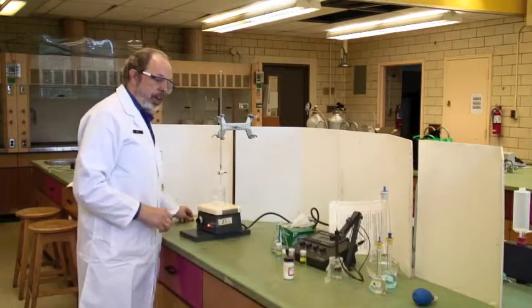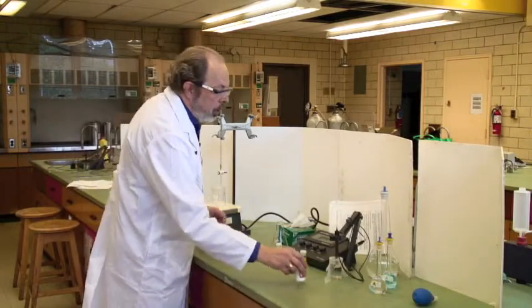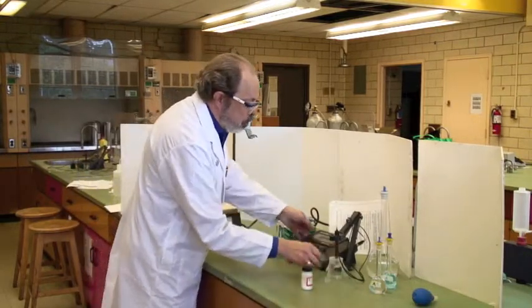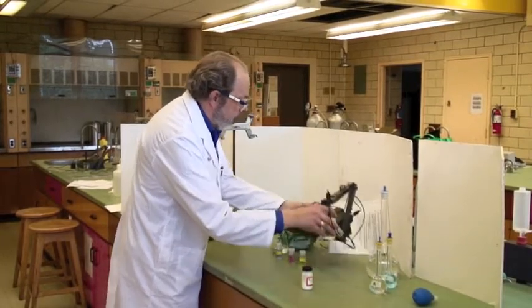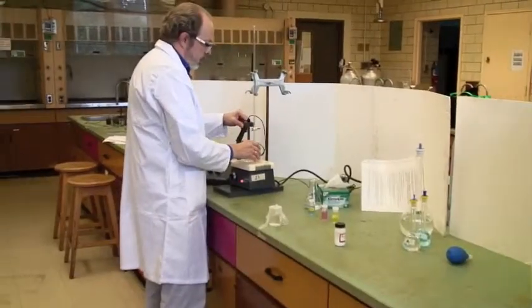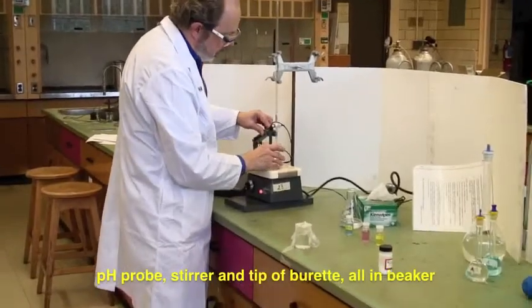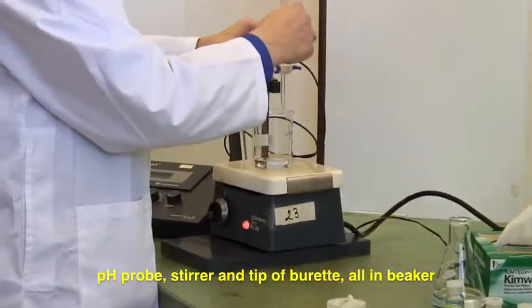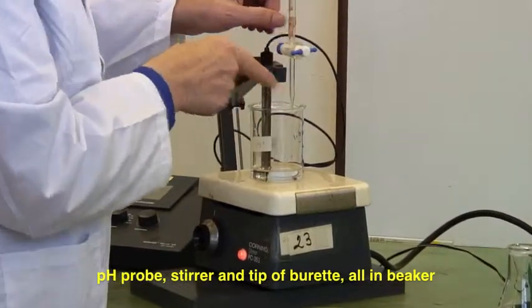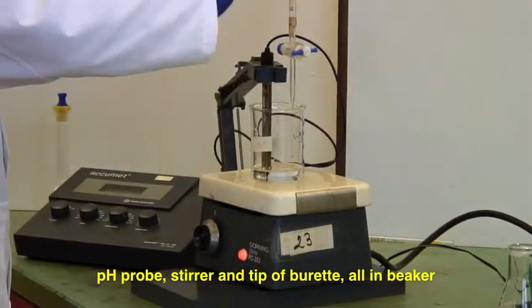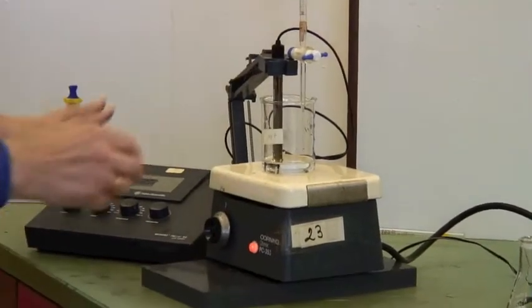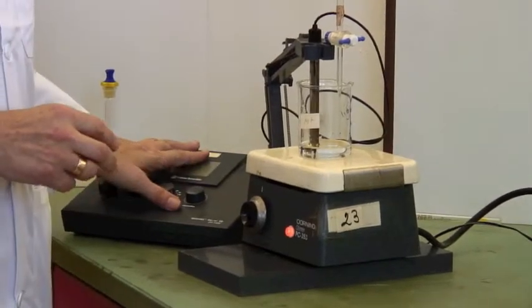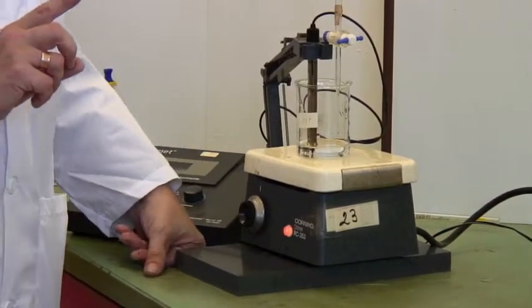Instead of a color indicator, you'll use a pH meter. Position it so the pH probe is in the beaker, along with the tip of the burette, ensuring nothing is lost. Turn on the pH meter. I'll show you how to calibrate it shortly.